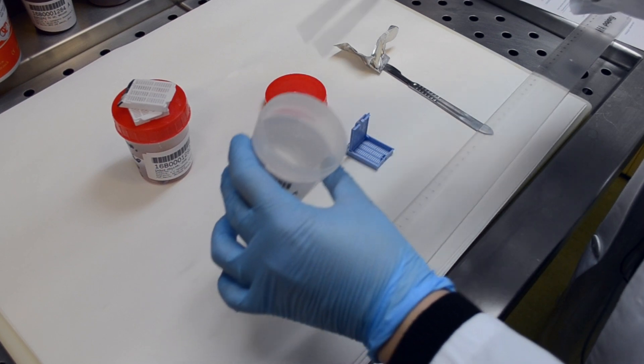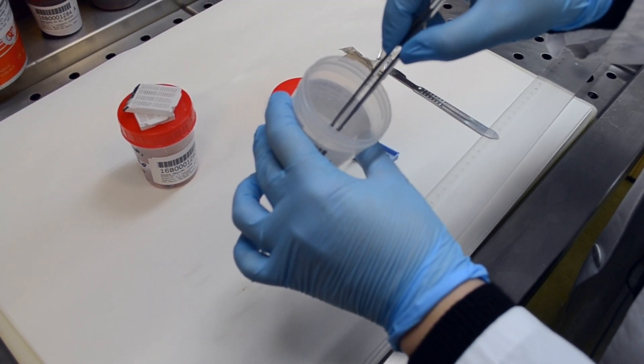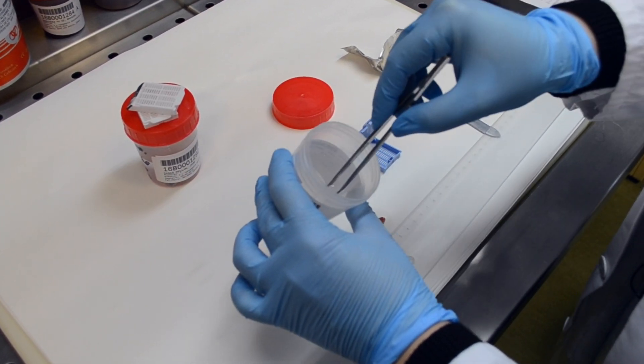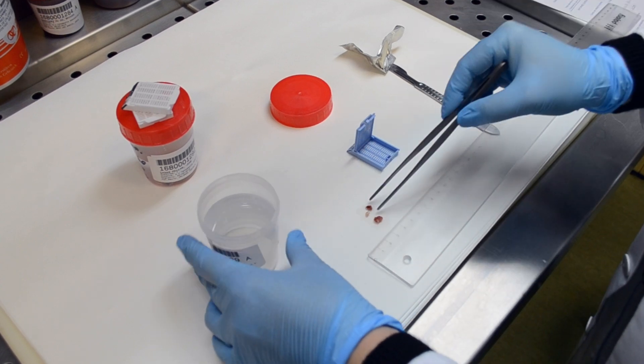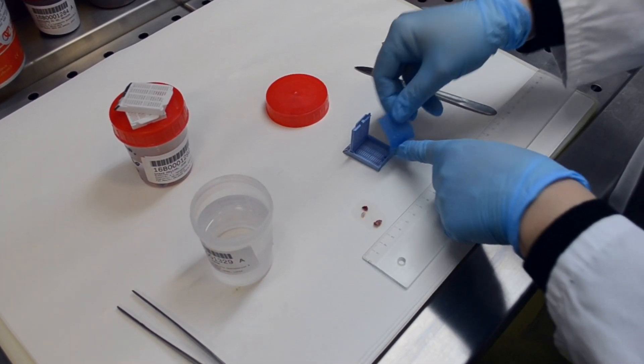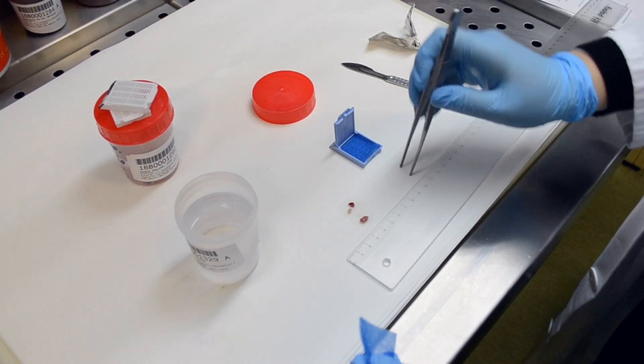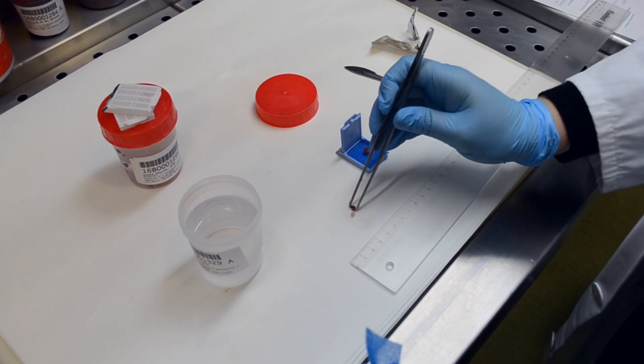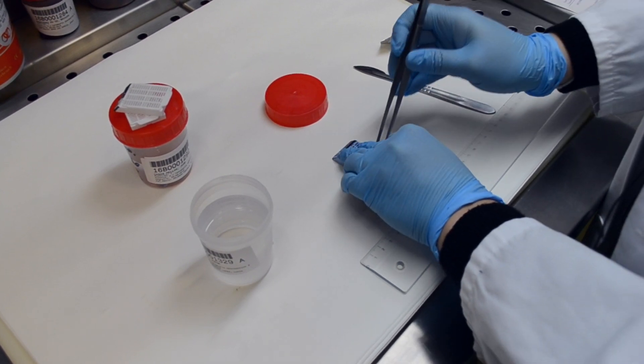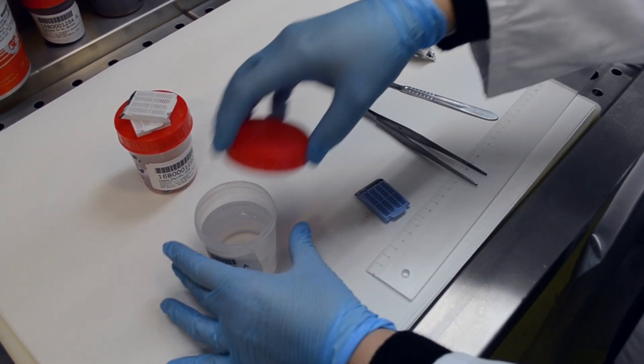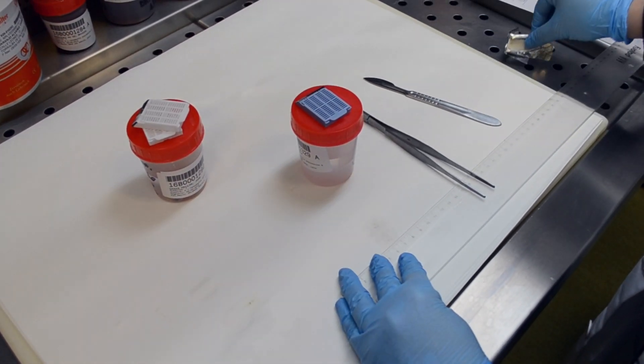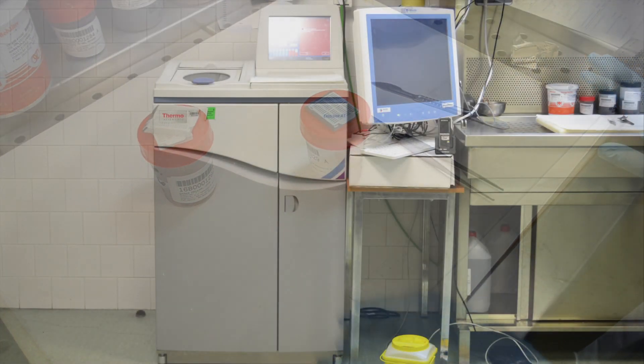In order to see the tissue under the microscope, we need to cut it 3 to 4 microns in thickness. To be able to cut it so thinly, the tissue is embedded into paraffin. The problem is that paraffin is hydrophobic. That is, it does not merge well with water, and fragments come in formalin, which is an aqueous solution, so we must remove the water from the tissue. Thus, prior to paraffin embedding, samples must be dehydrated by replacing water in the tissue with ethanol first, followed by xylene, and then finally warmed paraffin wax.